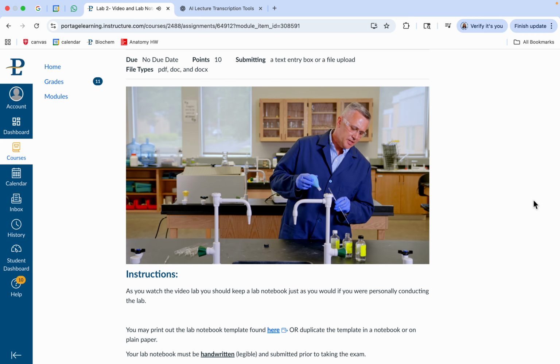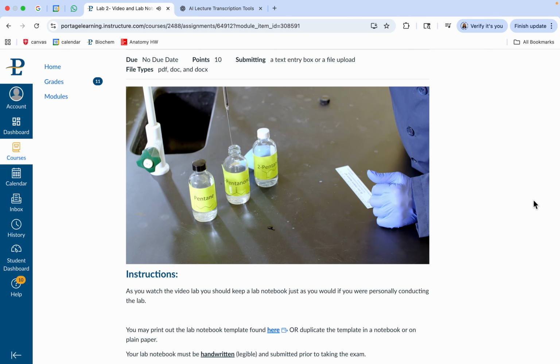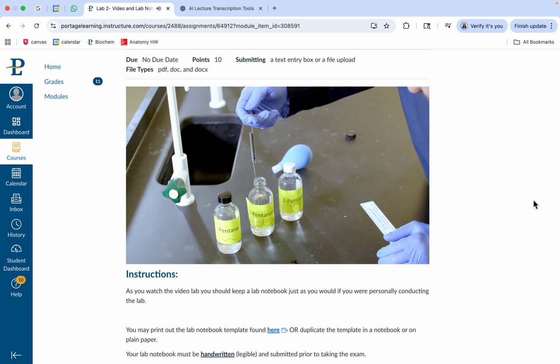All right, so let's do the same thing now for pentanone. Remember pentanone, the difference is it's still 5 carbons, but it has dipole forces because of that ketone group. And I'll get this one. It's now at the top, so I'm going to say start, stop. So you might have noticed that one was a little bit slower. It took a little bit more time.